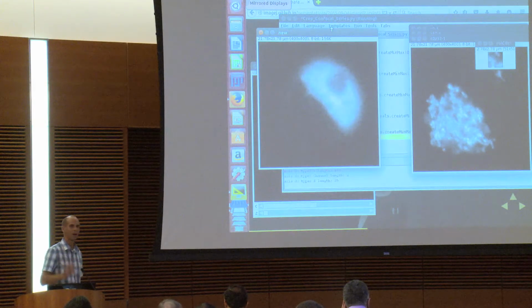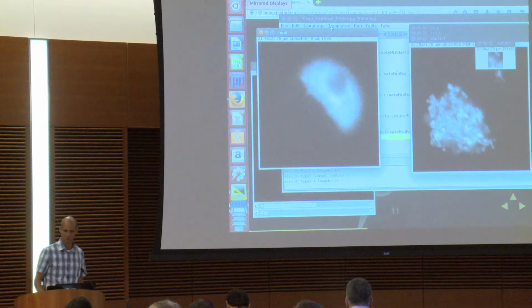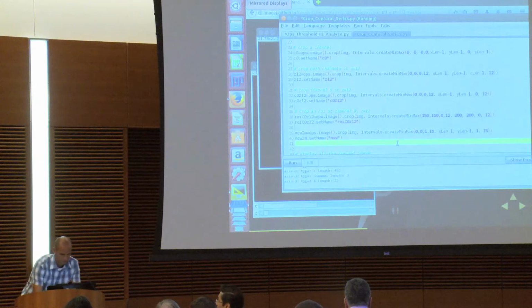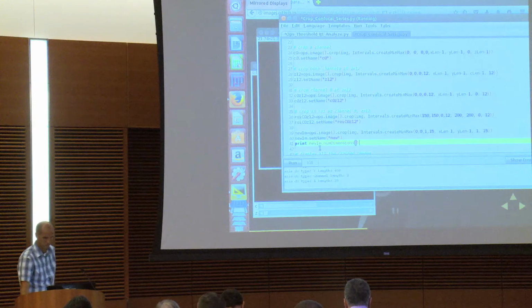I'd have to print it out because I know it's supposed to be reduced to be two-dimensional, but sometimes you end up with dimensions with length 1. Just throw a number on there and see the number of dimensions. Everything's coming back as input stuff, right? I don't remember.